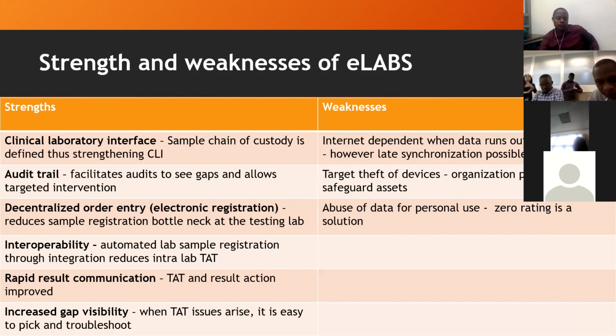However, it also has a few weaknesses, in that it's dependent on internet. However, late synchronization is possible. The theft of devices is another weakness, and the organization has a policy to safeguard these assets, as well as abuse of data by personnel in facilities, where zero rating is a mitigation for this also.